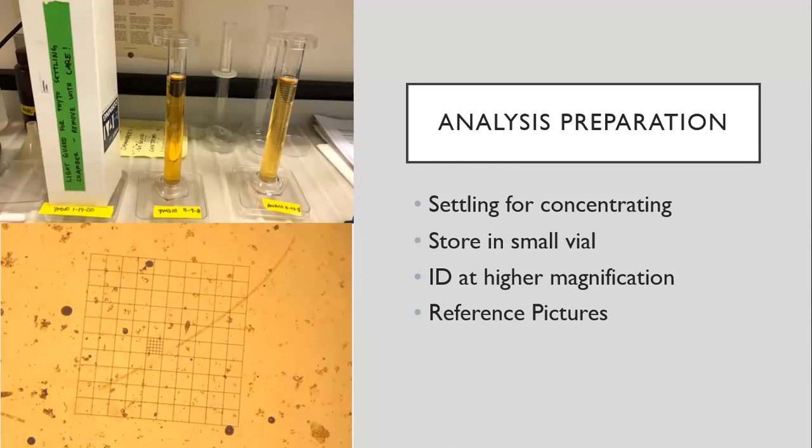So in some months, there's not a high concentration, or sometimes time of day, there's not a high concentration of phytoplankton in the water. So we'll just use gravity settling method to concentrate these samples, so they're easier to count all in one go. So once this happens, you have to wait.